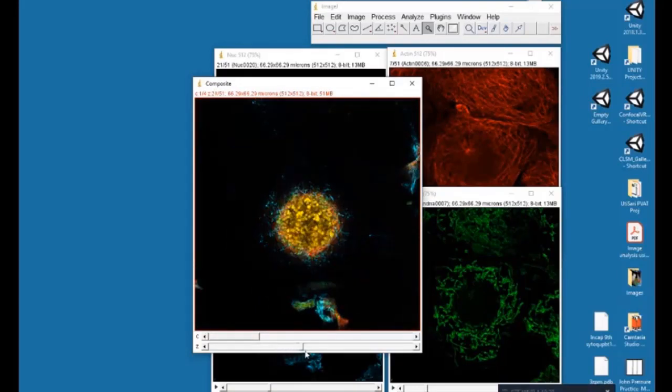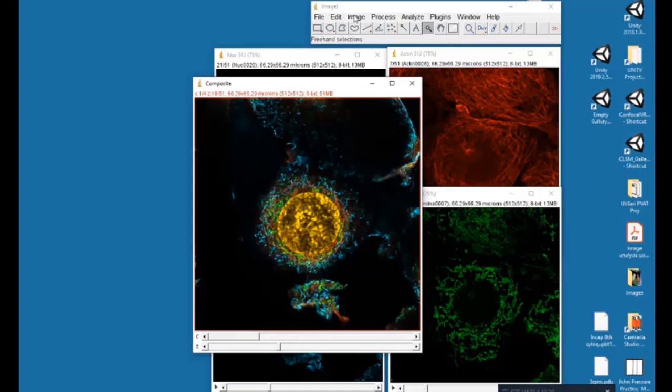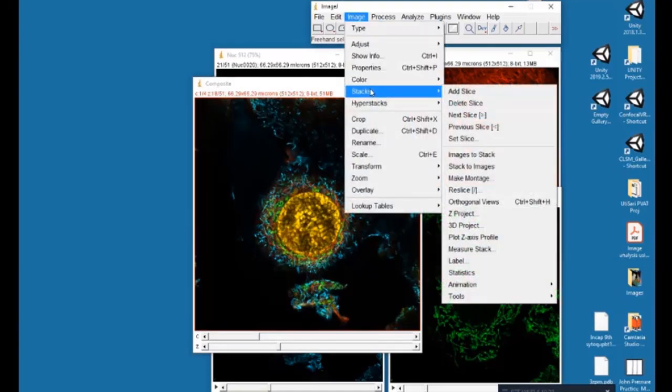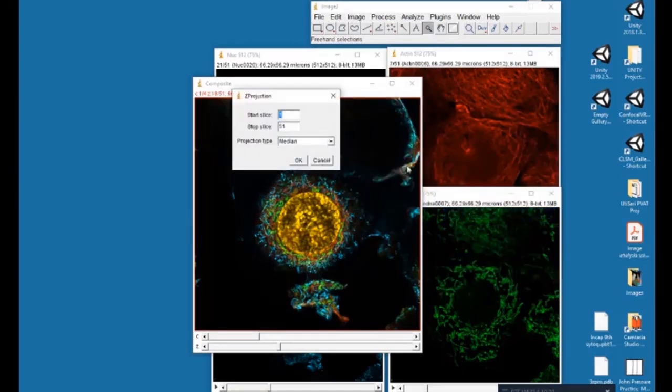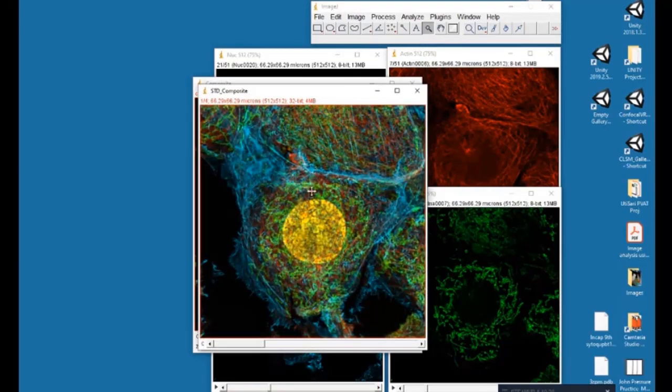I hope you can see that. Here we see a four channel COS cell. It's been labeled with stains for the nucleus, actin, tubulin, and mitochondria. We can combine these four channels to make a z-projection and I've shown that in a previous tutorial.